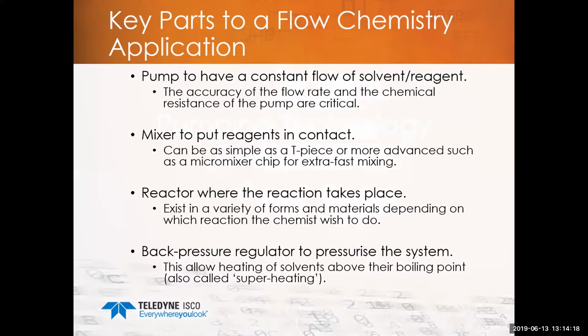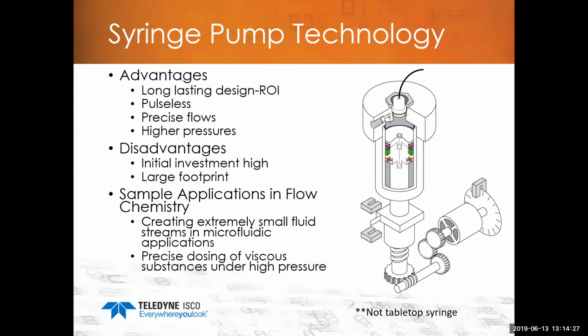So let's look at syringe pumps. Syringe pumps have many advantages and a few disadvantages. The advantages are long-lasting design. It's a very basic, gear-driven design. We've been doing it for a long time. Of all the different types of pumping technology out there, it is considered to be the closest to pulseless as possible, if not pulseless. Very, very precise flow, and higher pressures you can reach.